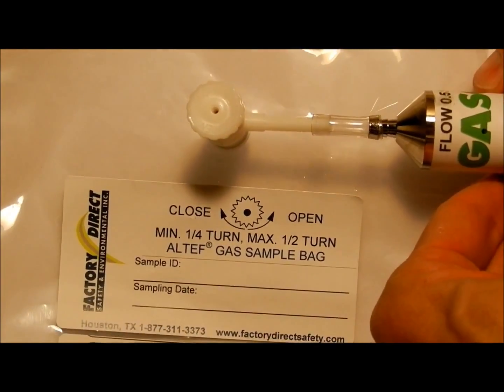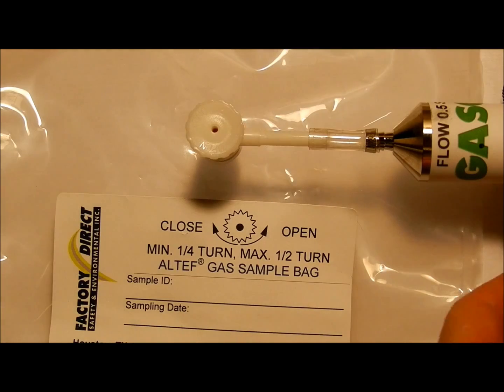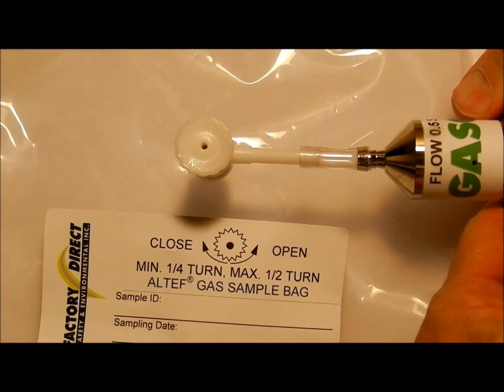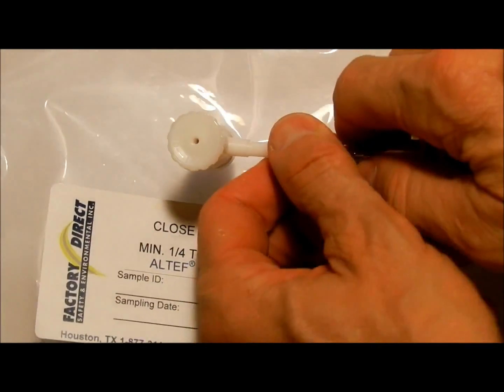Apply your gas sample and allow gas to flow to fill the bag. When you're finished, stop your gas supply and then close the valve and disconnect as needed.